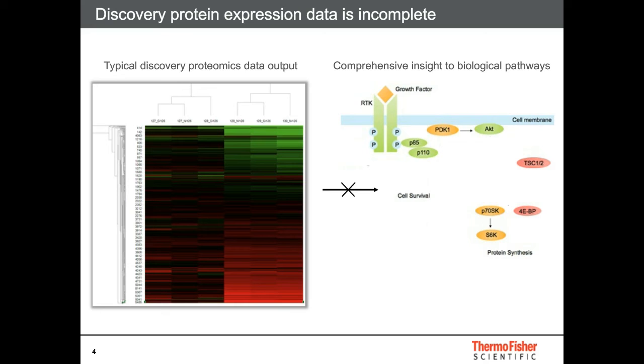In addition, many of the PTMs that have known function in the literature may not be identified by MS due to low protein sequence coverage. This lack of comprehensiveness results in major gaps and provides an incomplete analysis of the proteome, making it difficult to test hypotheses regarding specific proteins or to validate data observed with immunoassays such as Western blot or ELISA.